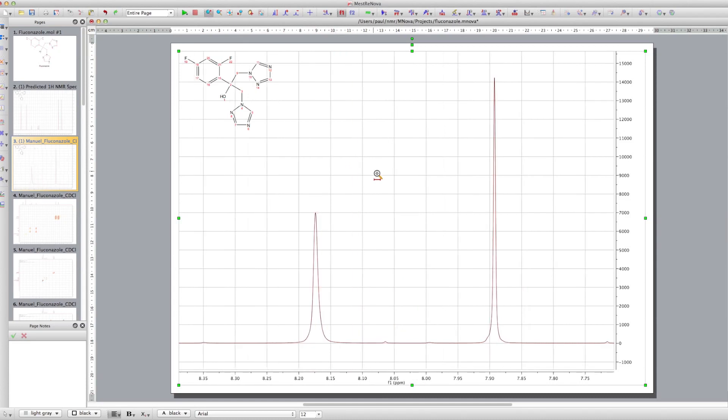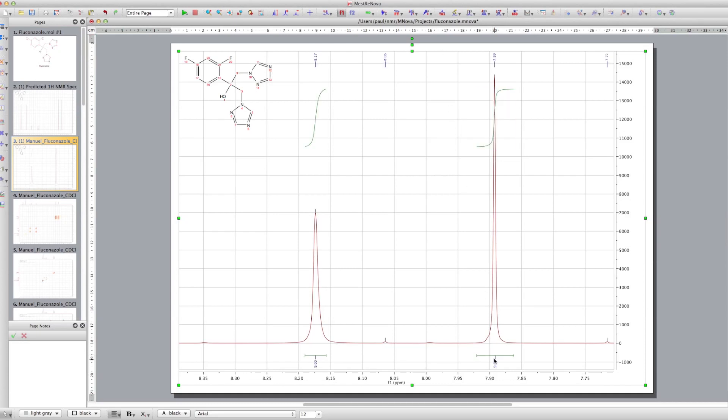But it's a lot more complicated than the predicted spectrum. And that's perfectly acceptable. The predicted spectrum will tell us whereabouts the protons should come, the type of splitting pattern we should have. But then in reality, what you have is a lot of second order effects which will make the peaks look a bit different.